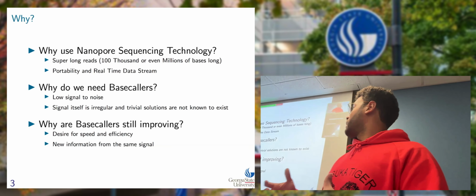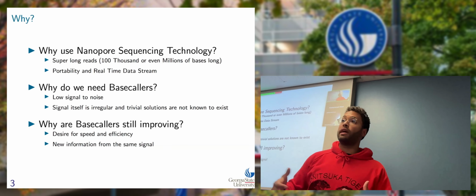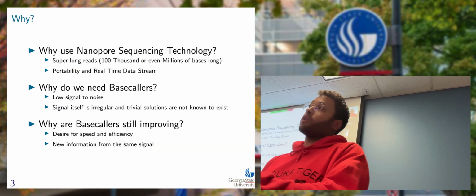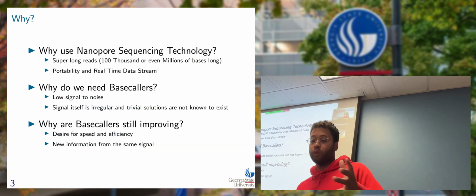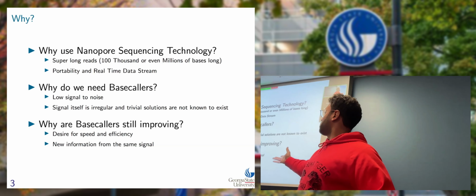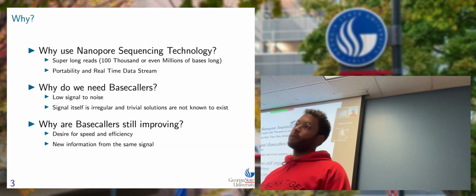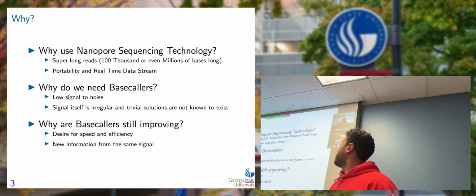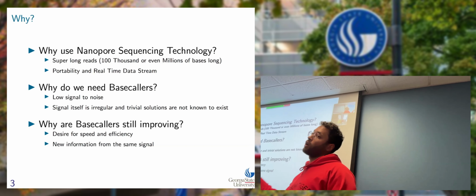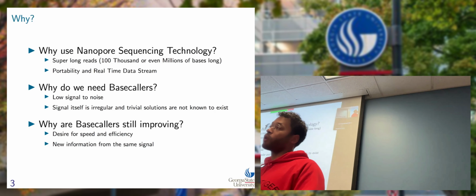Not only that, these base callers that take this noisy signal and return these bases are still improving, right? Why? Because as time moves on, and like I said, Minion is a small portable platform.